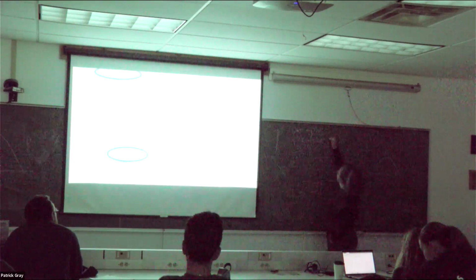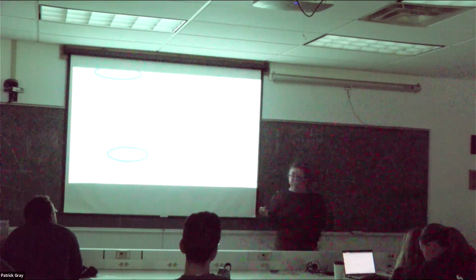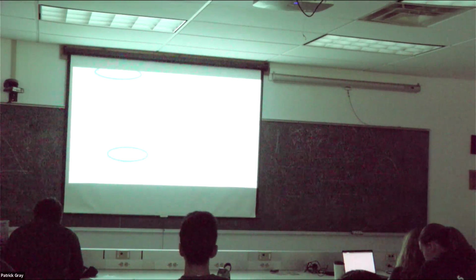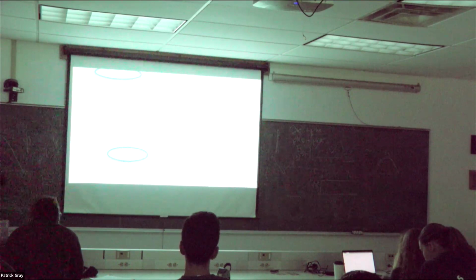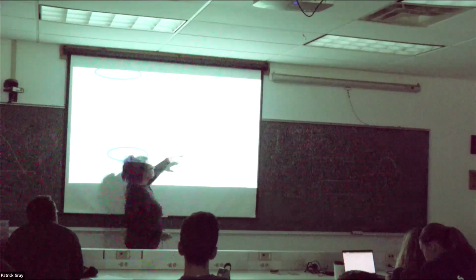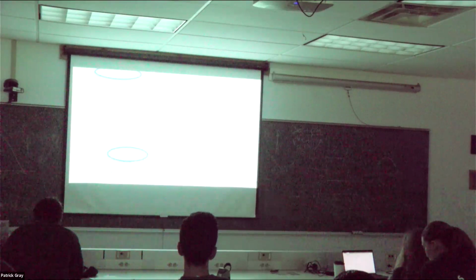Okay, so one minus the other is chlorophyll, because I know how to correct for the quantum yield of fluorescence of each of these specific things. That's going to solve the issue that I have with phaeophytin if I have a very narrow band detector, but I don't. And it doesn't solve the problem of chlorophyll b and chlorophyll c. They're still going to be in there.